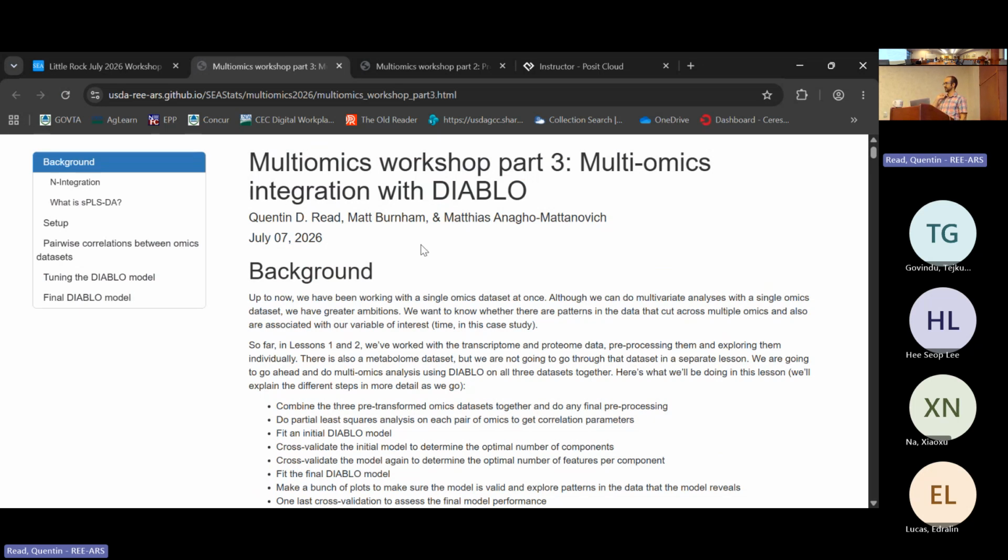Yes. I just have more of a conceptual question. Go for it. Let's say you skip the first 2 parts, just the DIABLO integration. What would be the key things that you'd be missing? Yeah, I think you could get similar, hopefully, individual features that were important in the DIABLO would also be important if you just looked at each of the omics in isolation.